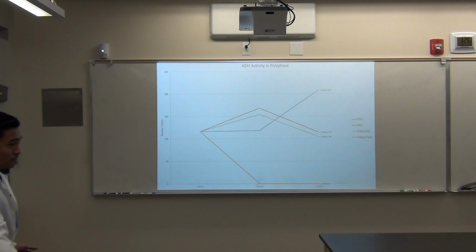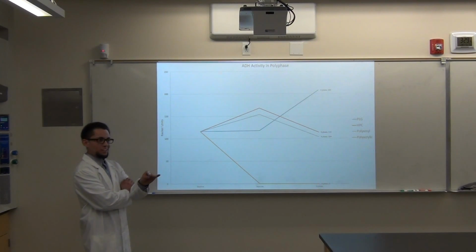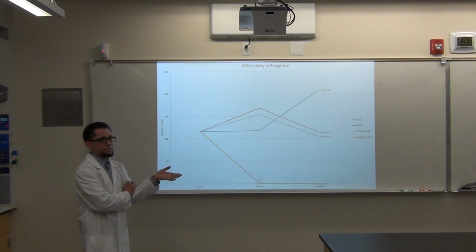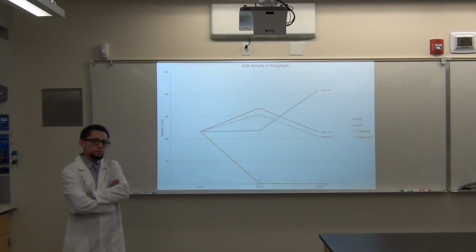Yeah, do you have a theory, Daniel, why the acrylic went to 0? Okay, so it reached threshold. It was the salt concentration. It reached this threshold, and that's pretty much it. And the nature of the protein. Yeah, so that would be a good guess. So that would be our guess, the salt basics, and that's why it precipitates out too, right?